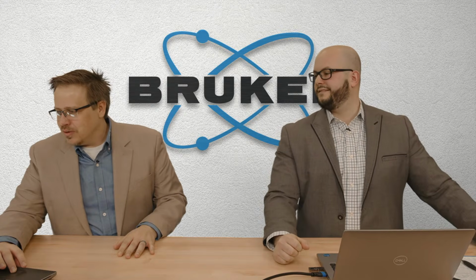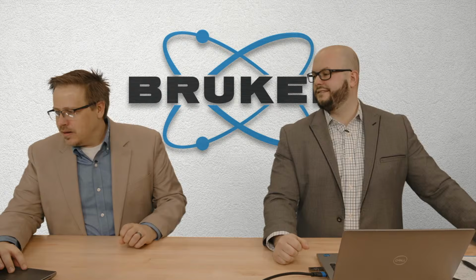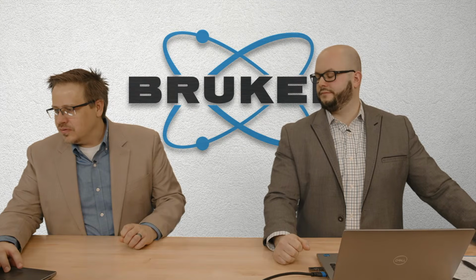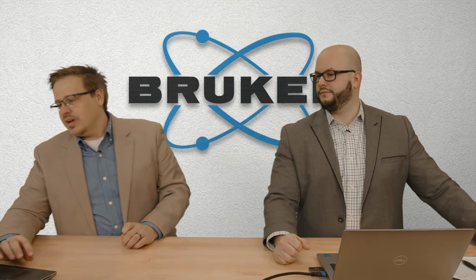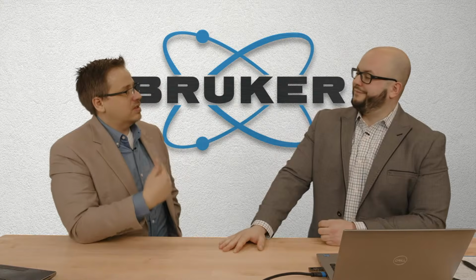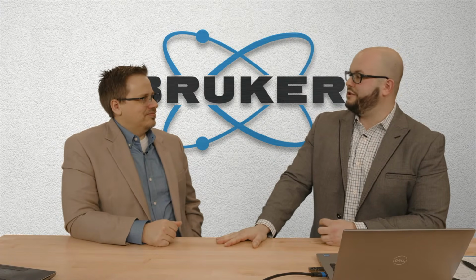So from Akshay: hi, what does it mean if we get different stress values with different curve fitting techniques, which vary by more than 100 megapascals? So they use different fit methods, and they get a different value. You probably have something going on with your peak shapes.